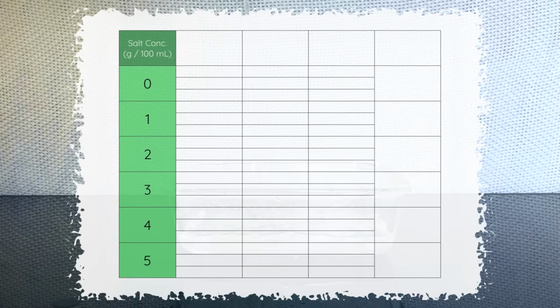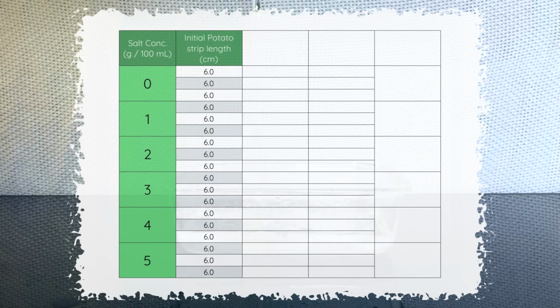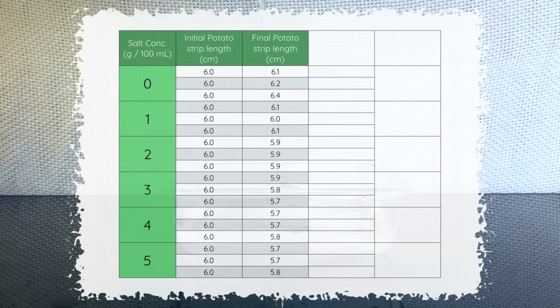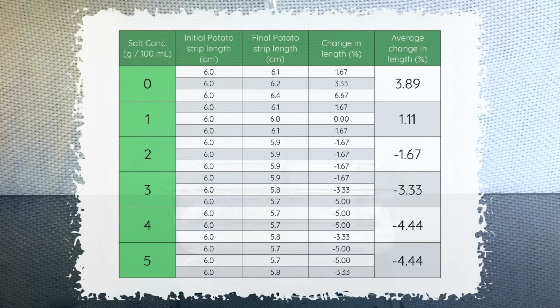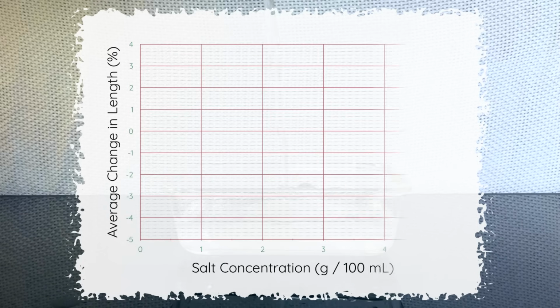To process the data, you need a table of results with all concentrations listed, as well as the starting lengths of the strips. These all started at 6.0 centimeters. In the next column, put in the values you measured, and then calculate the percentage change for each individual strip. Notice the negative sign on some values. This tells us whether the strips increased or decreased in length. Next, you can take an average of changes in length. These are the values that we need to put on the graph.